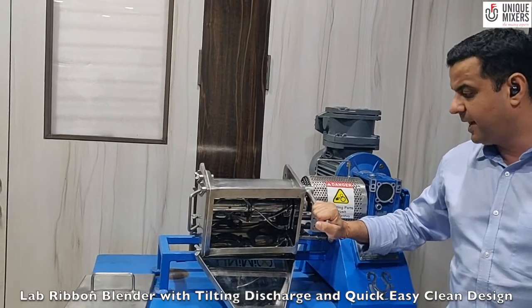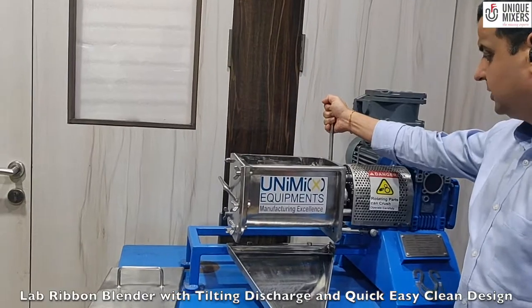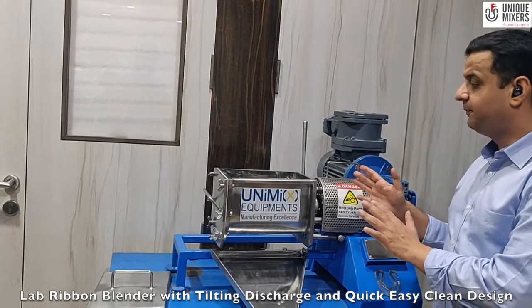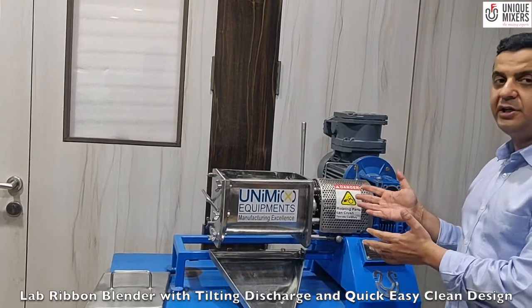If I need to put the blender back into operation, I just tilt it back. The best part about this design is this is a quick clean design. First, I am able to achieve 100% product discharge. Second, I can clean the mixer and the agitator in quick time.